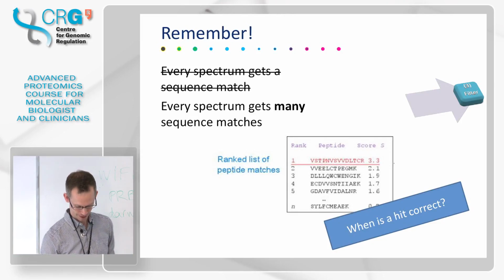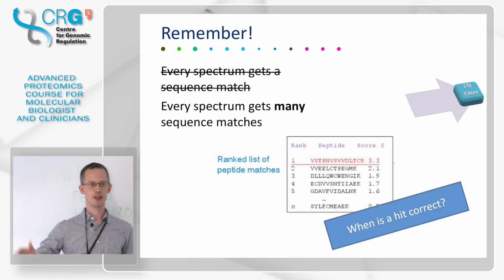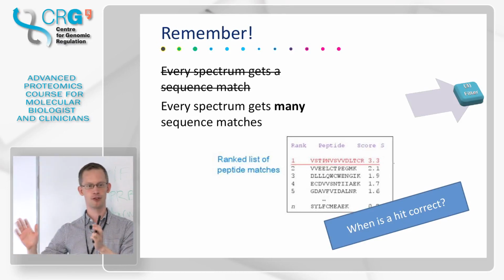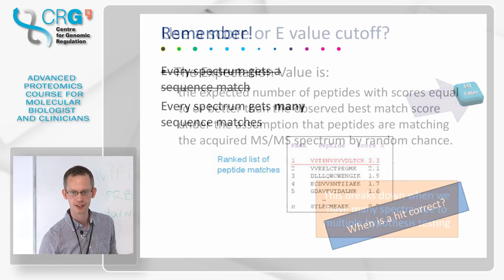Yes. Good. So this moves to the last section here, which is called the filter step. This is essentially trying to set a line somewhere that says, okay, these we call identified. These we don't trust because they're probably just random noise assignments. These can't all be true, for instance.